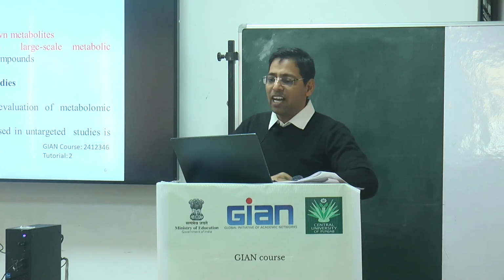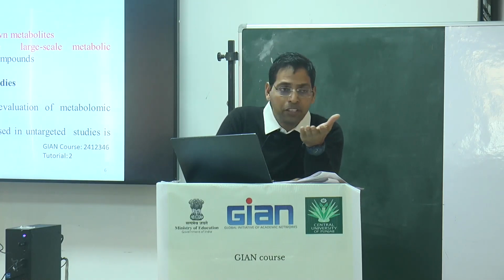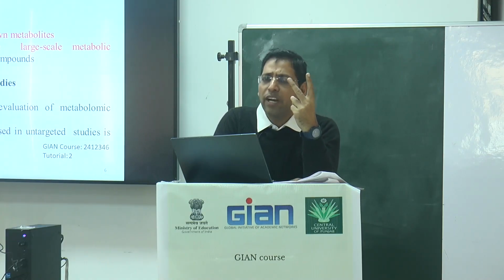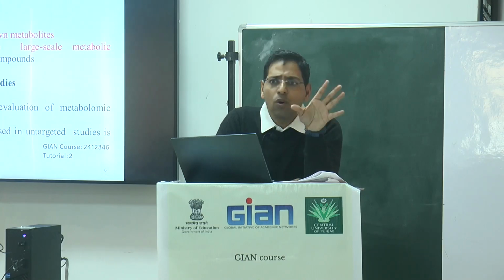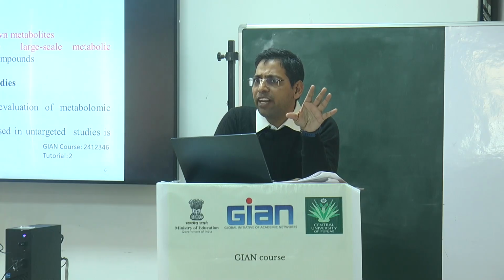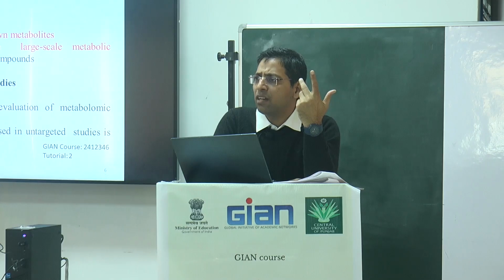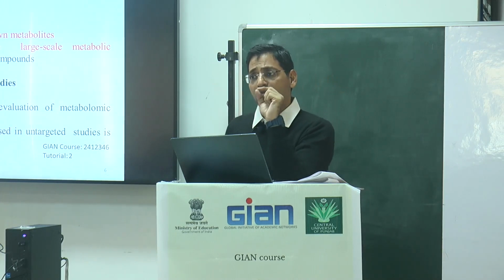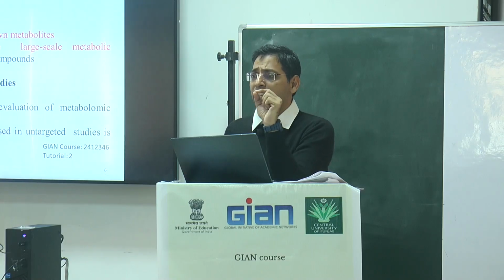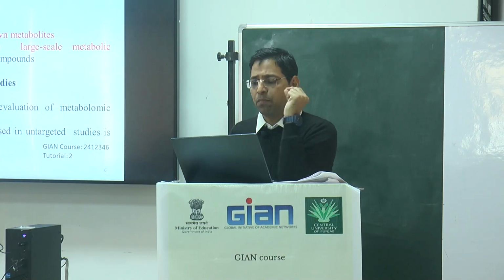Targeted metabolomics is basically large-scale metabolic profiling, because you need to analyze only a few metabolites. So you can do large-scale metabolite profiling of thousands of samples. But if you are doing non-targeted metabolomics, don't think you will take more than 2, 3 or 4 samples, because you don't know, no? If you take 100 samples, it will take 2 to 3 years to analyze those data, so there is no need to do that. But yes, whatever data you get from one sample is very comprehensive. You have to do a very comprehensive investigation to find out the different metabolites which are present.